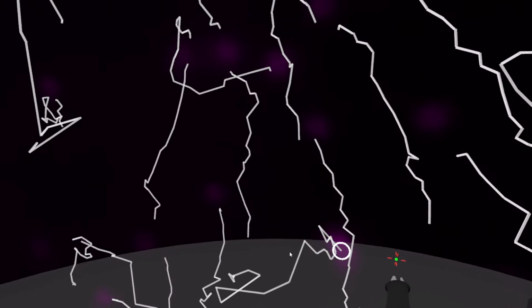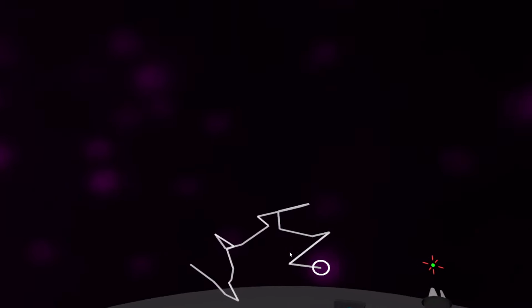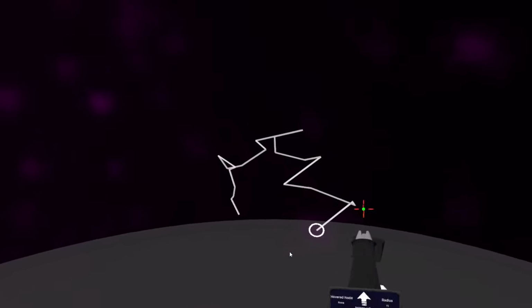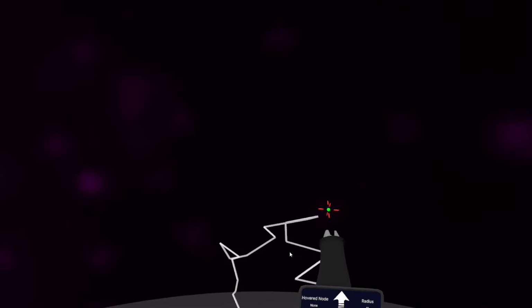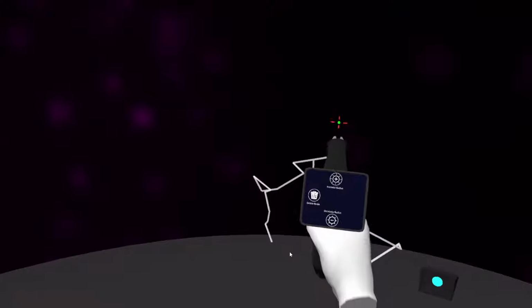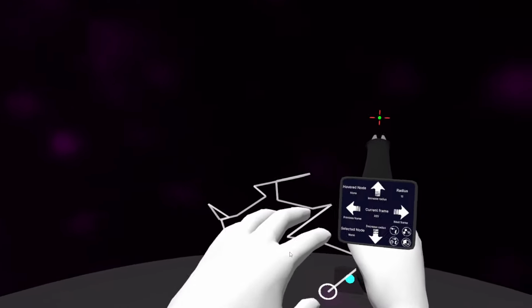So this is how you can track in VR, and this is extremely fast. This is like hundreds of times faster than doing this on Mamut, right? So if for whatever reason you have a cell that is selected and you see it here, it's a selected node, and you would like to deselect everything, just stay pressed on the trigger until you see the menu appear, release in the emptiness, and now selected is to none.